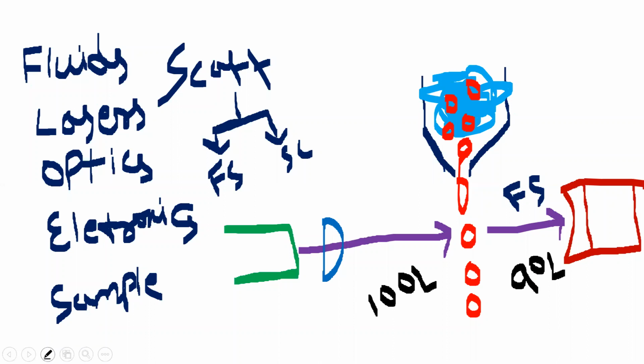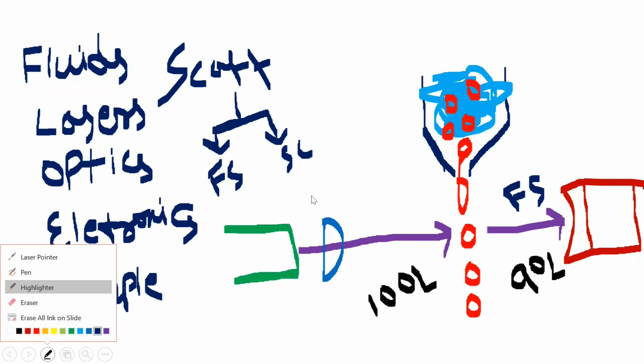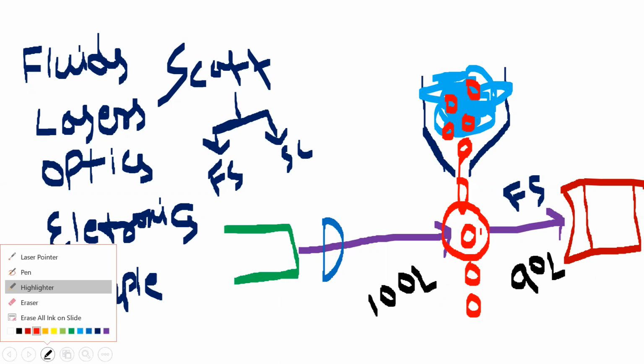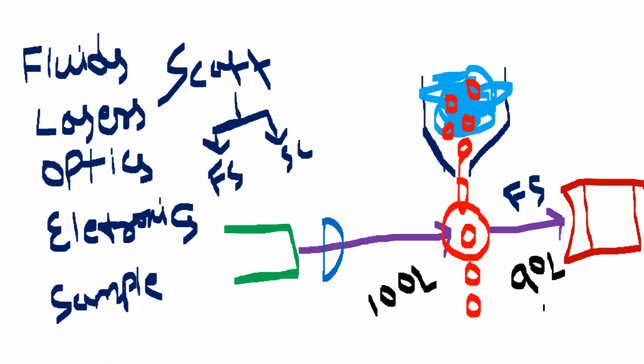Let us assume the cell is somewhat larger. So a very large cell passed via laser light. If a very large cell passes, what happens? Then the forward scattered light will be decreased, because most of the light will be obscured by the cell. So the amount of light I will receive here will be only 60 lumens. So 60 lumens for a large cell. So this is a big cell.